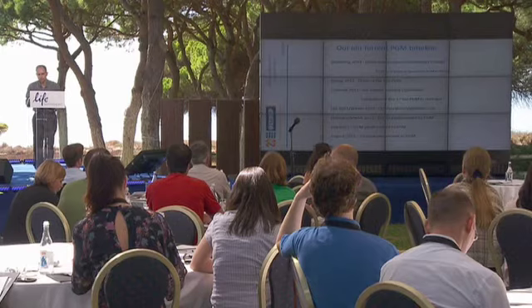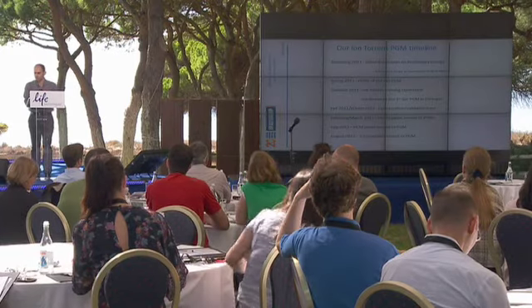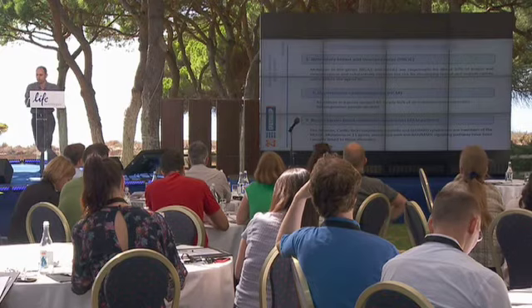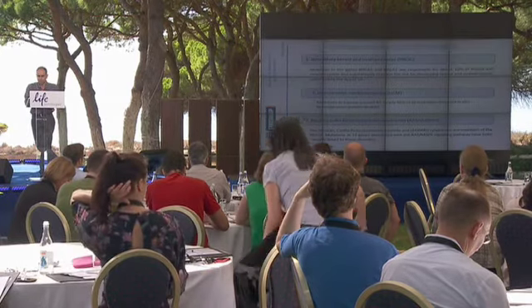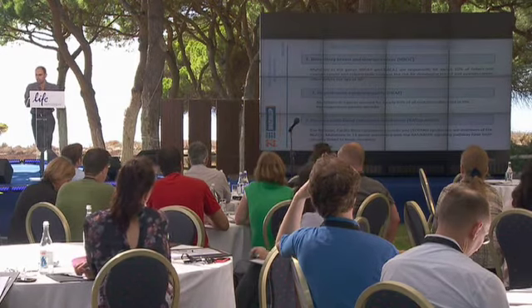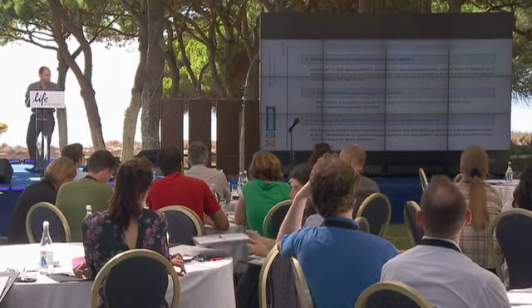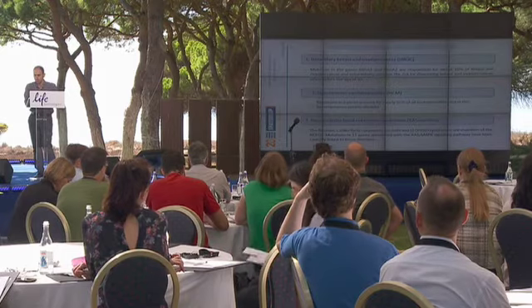So what I will talk about today is our approach and how we did this shift from Sanger to the PGM Ion Torrent. The panels that we started with were essentially 3 panels. One that we used as our first testing panel was the BRCA1 and BRCA2 genes. Those are 2 genes that are very particular and have a lot of challenging characteristics, and we wanted to see how the technology could address the sequencing of the 2 genes.